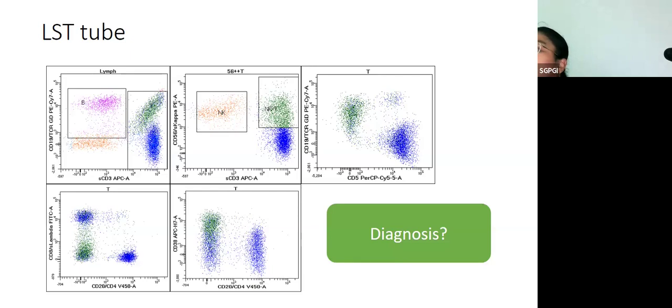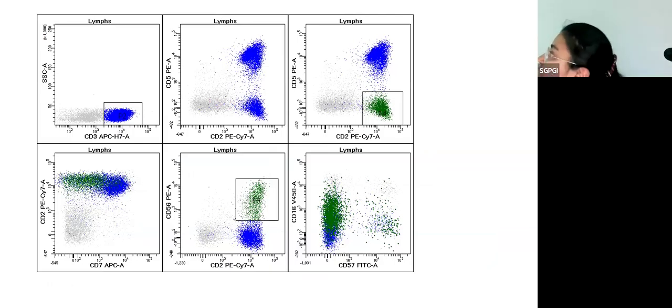Gamma delta proliferation or gamma delta lymphomas, if we think on top of our head would be hepatosplenic T-cell lymphoma, subcutaneous panniculitis T-cell lymphoma, which this presentation would not justify, and there is the cutaneous gamma delta proliferation. Very likely with the presence of this splenomegaly, with this pattern you are dealing with hepatosplenic T-cell lymphoma. We realize that there is this population that is CD5 negative, CD2 positive. They are also showing a down regulation of CD7. These cells are CD56 positive. When you look at CD16 and CD57, CD57 is nearly absent in majority, while CD16 is expressed at a dim intensity.